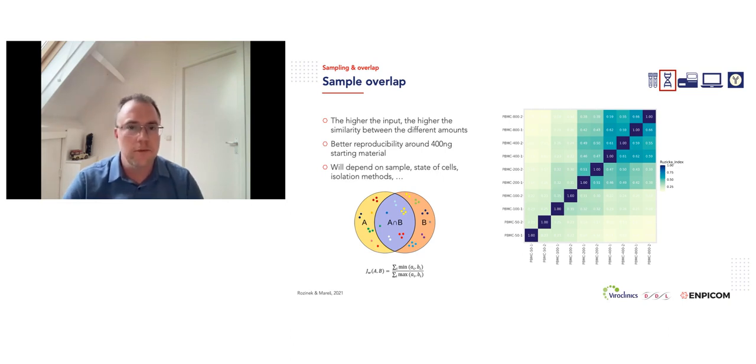For quantifying the overlap here, we use the Ruzicka index, which is a sort of weighted Jaccard index, and essentially tries to see on a read level, do I see the same receptor in the two different samples. So it weighs in the size of the clonotype that you identify. Large clonotypes have a larger weight than singletons.